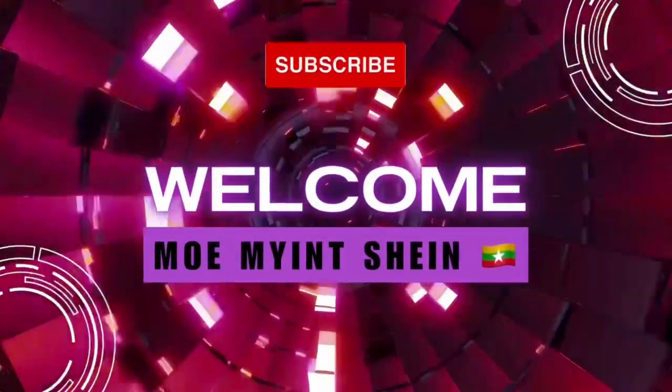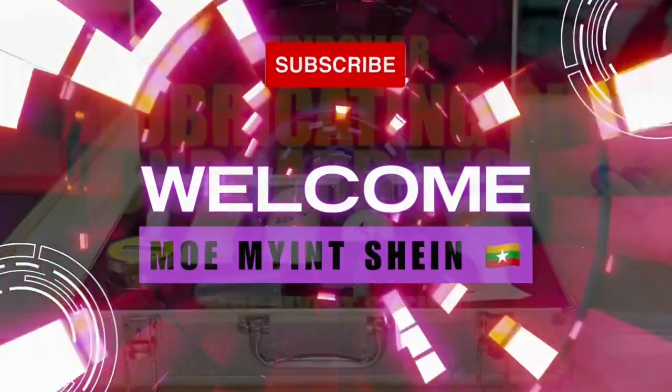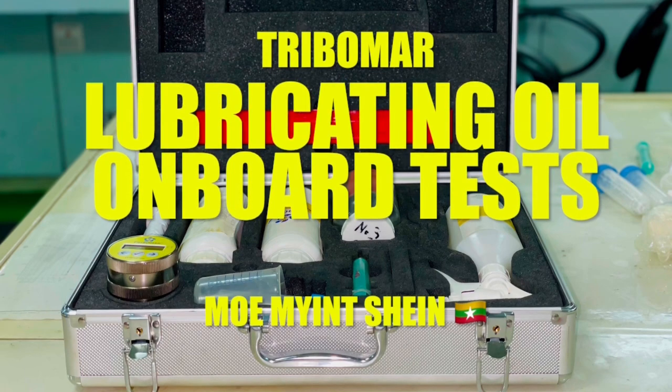Welcome from Momi and Shine technical channel. In this video, you can see how to carry out lube oil on board test by using the Tribomar test kit.